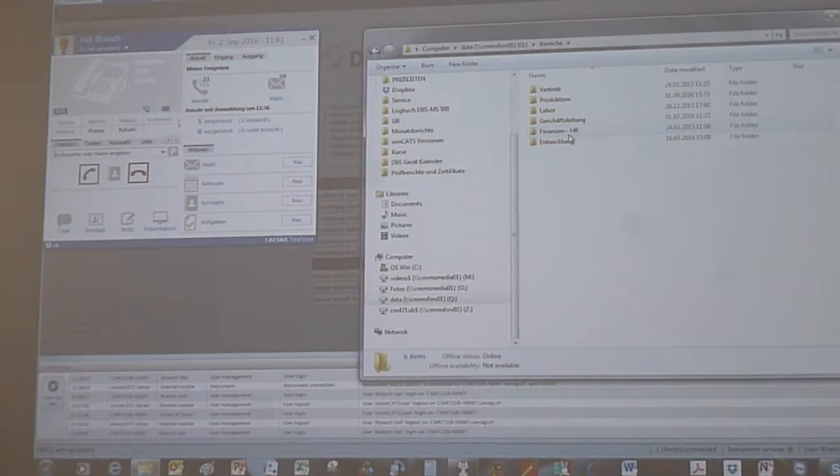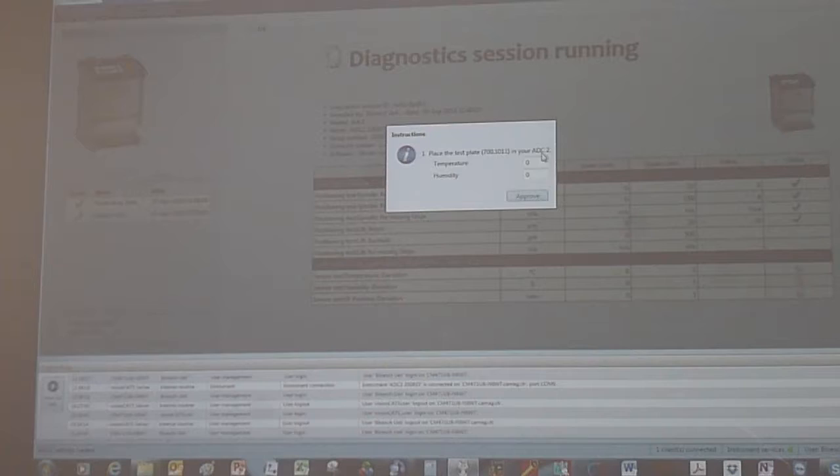Okay. So maybe, did I show the video already from the ADC2? You know the videos that are available for ADC2? No? Okay, then we have to go quickly, because they are quite nice to understand what's happening, and they are also quite new.